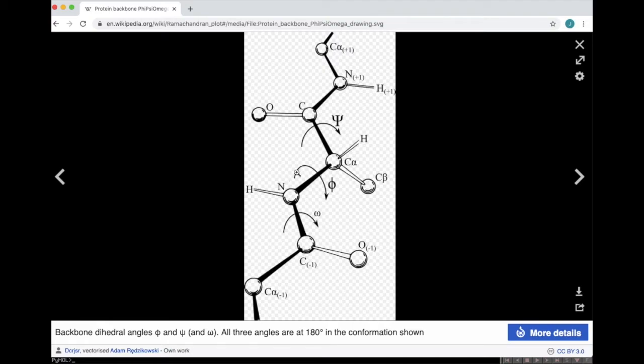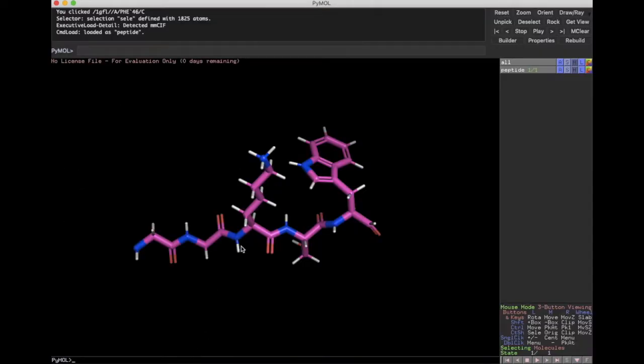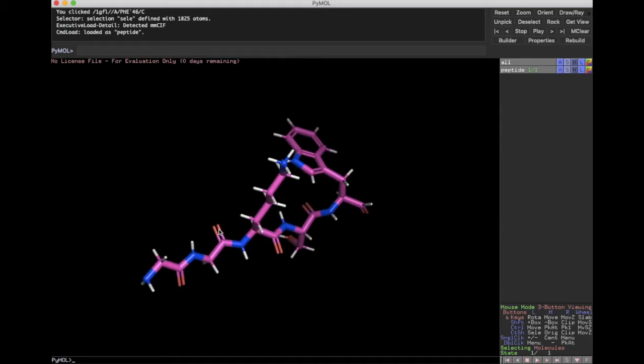And these are really important for the backbone, and there's only certain ways that these can twist. And in many cases, it's because if we look back at our structure here, imagine if you twist these backbones so that, let's say you have the oxygens pointing in the same direction, then you're going to have negative charges on the same side, which can actually cause repulsion. And if you twist them, then you might also have hydrogens on the other side, which are slightly positively charged, which can cause repulsion, right?